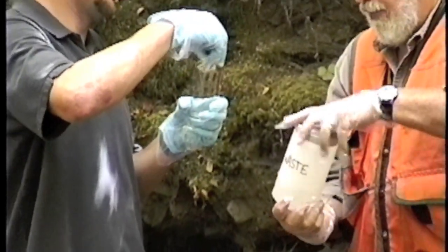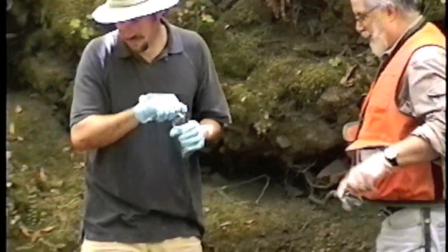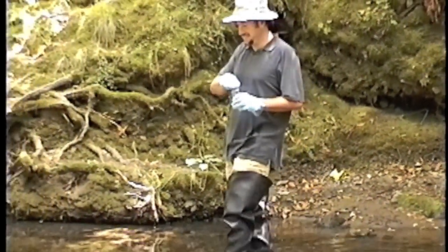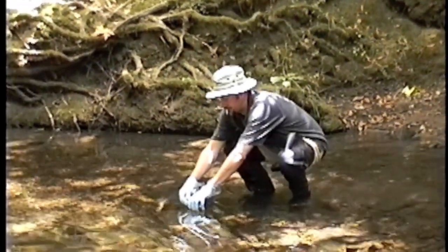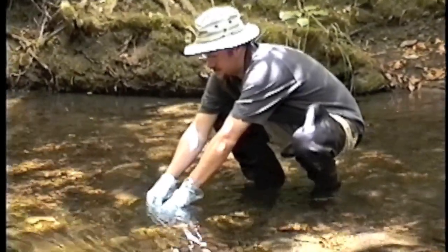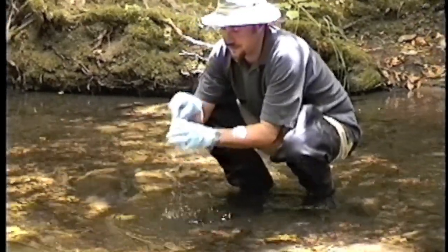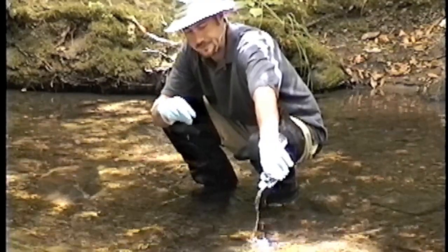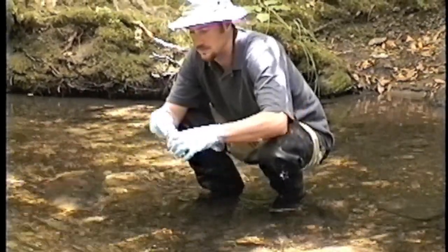Clean Hands will go to the center of the flow and collect the sample there. The subsurface grab sampling is the same procedure that we have seen for other procedures. What you do is you rinse the sample bottle three times, fill it under water, and discharge it downstream of your sampling site.